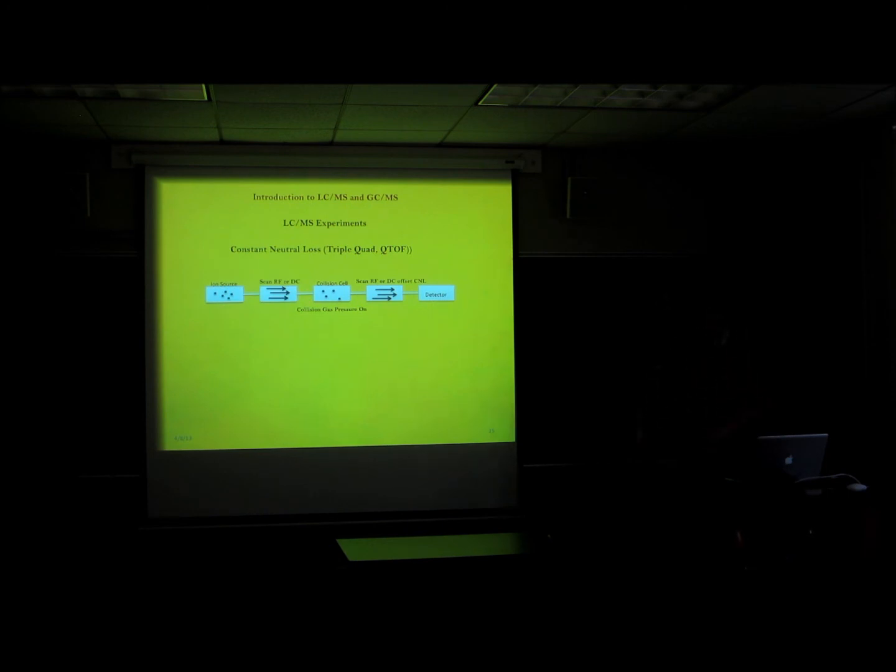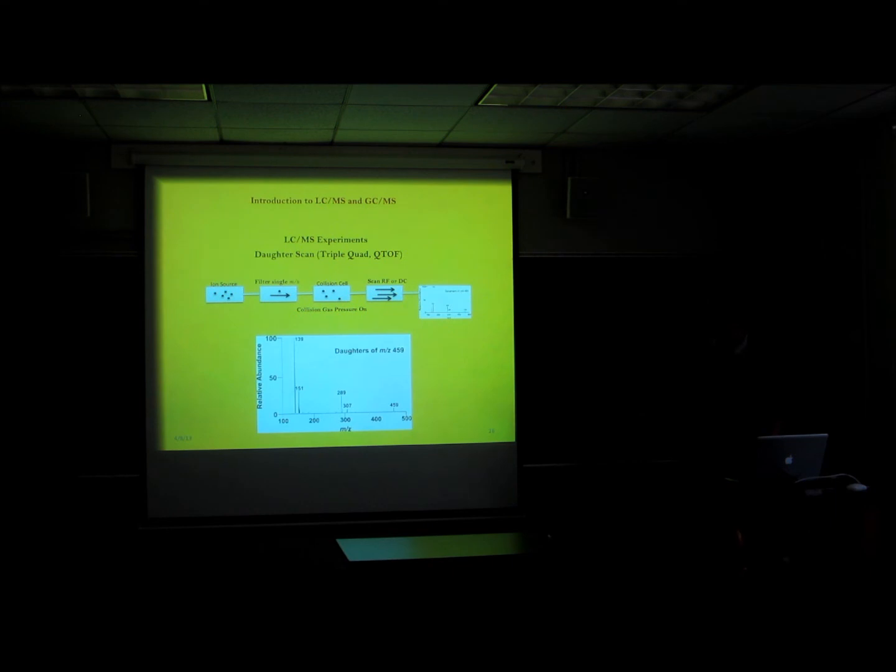You can do that for glycosylation, any sort of chemical modification you're interested in, and you want to see the full family of compounds that may experience that.